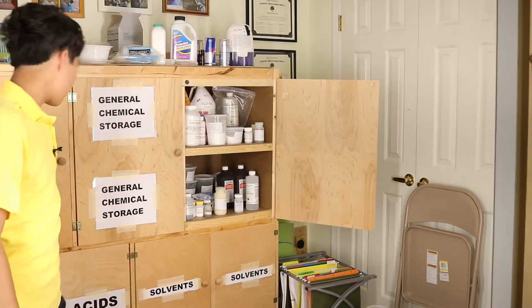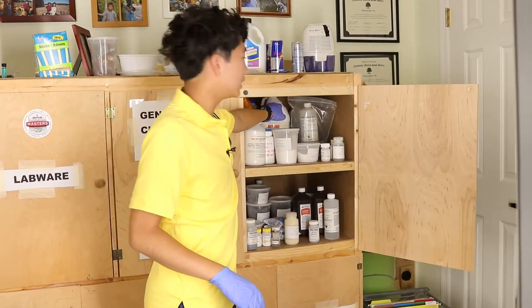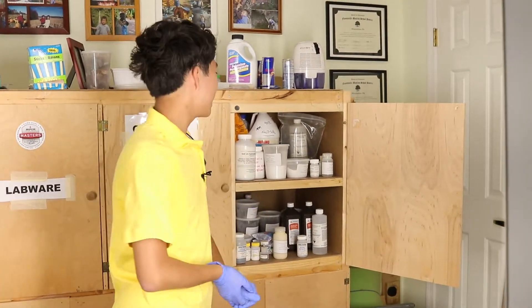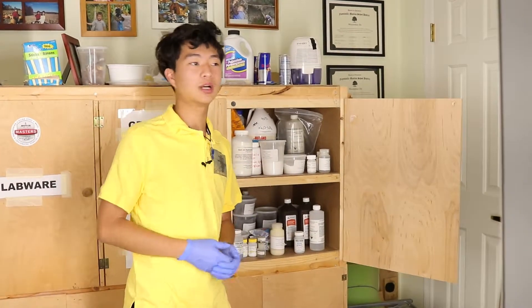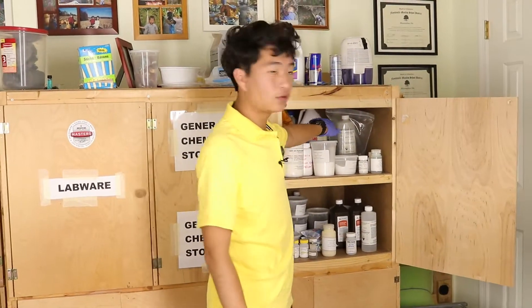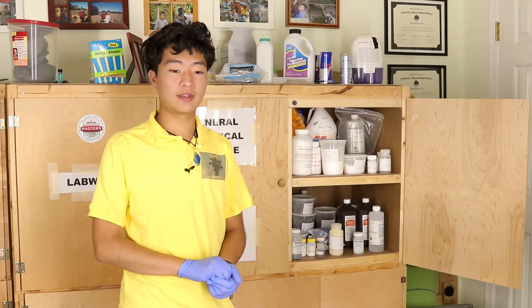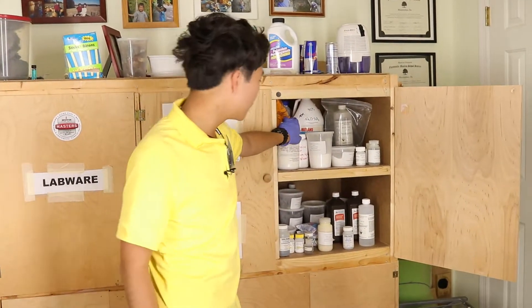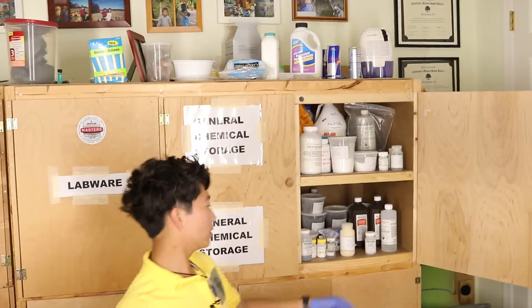Moving on to bases — they're the opposite of acids, which is why I store them across from the acids, so if there's a spill they won't react together. I have sodium silicate, sold as a concrete sealer. It seals glass extremely well — I once left a bit in a beaker and it solidified and stuck permanently. It's useful for polymerization experiments; it's called liquid glass. I have lab-grade ammonium hydroxide — none of that weak store-bought stuff — and sodium hydroxide, one of the most ubiquitous chemicals in any lab. This is lab grade, useful for titrations and much more.